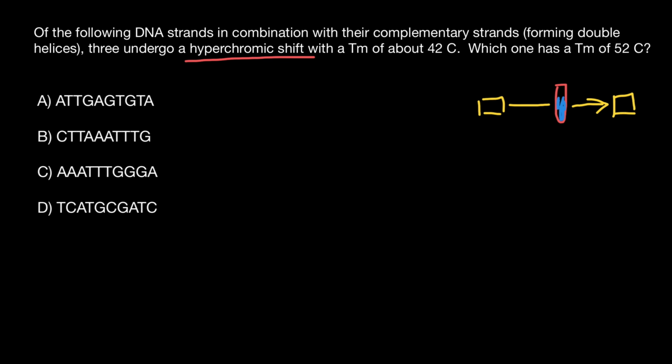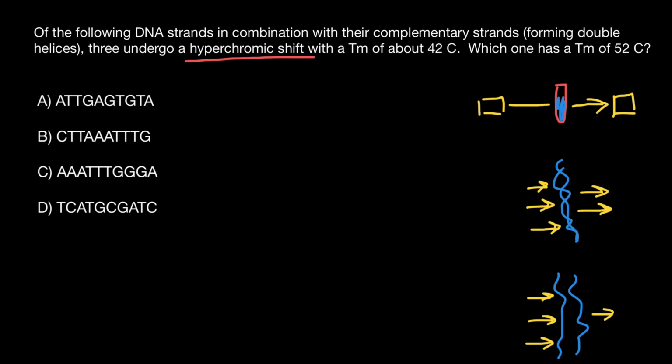We know the intensity of the light, and we can also measure the intensity of the laser beam at the detector site. Now imagine that this is a double helix, and that these two strands of the DNA separate. When the two strands separate, the absorbance of the laser light increases substantially. When we detect such a phase transition in light absorbance, we know that the DNA separated. So now the DNA, as we also say, melts.